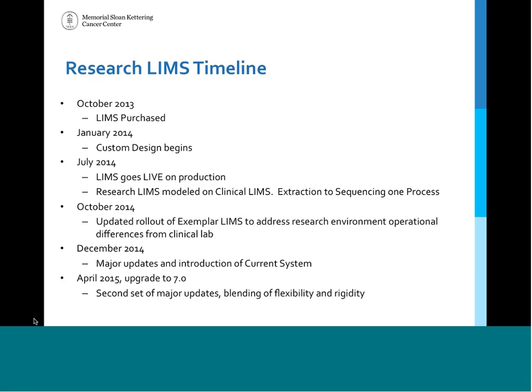So the research LIMS timeline: we purchased the system in October 2013. We purchased two systems, one for the DMP and one for the research lab. And then in January 2014, we started the custom design and really tried to make it work for everyone. We did have some research lab specifications, but we really tried to keep the systems as similar as possible. So in July 2014, we went live in production in the research lab, and extraction sequencing was one process. So we tested this out over the summer.